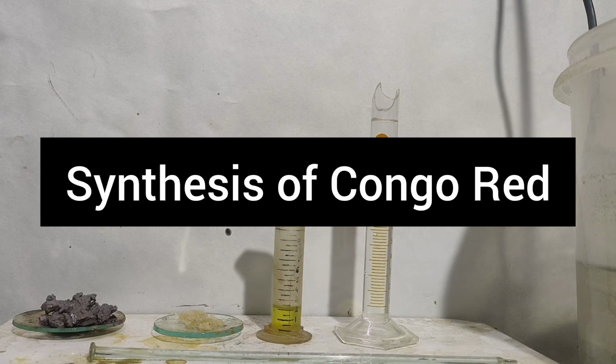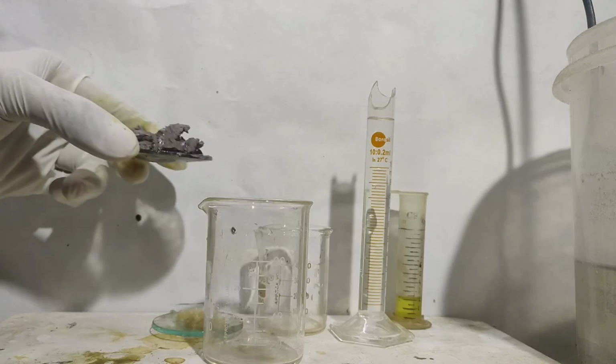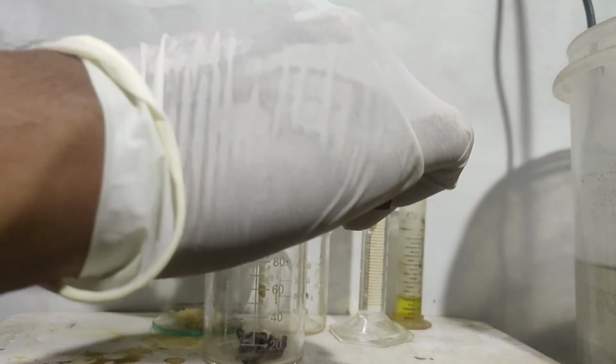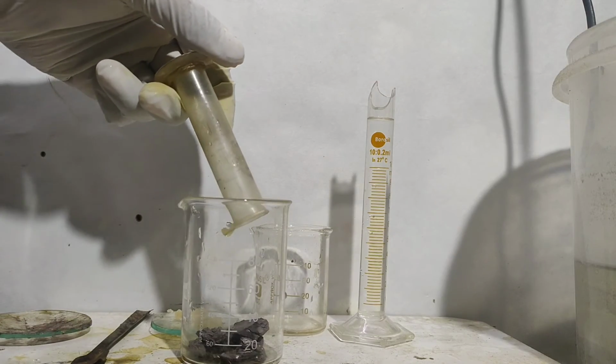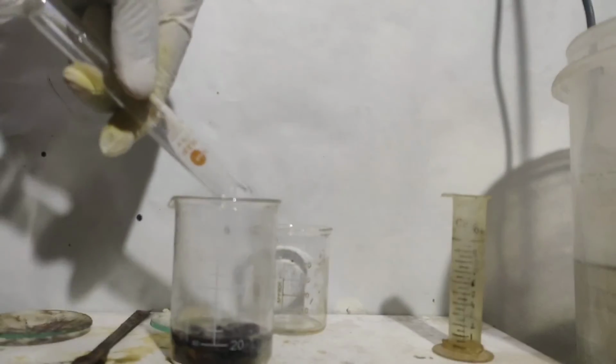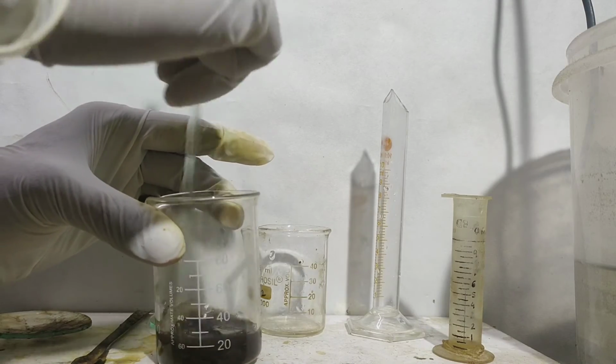Now to make Congo Red, I measured out 1.6 gram of benzidine, 1.24 grams of sodium nitrite, 2 ml of concentrated HCl and 12 ml of water. I transferred the benzidine into a beaker and added the HCl onto it. Then I added distilled water to it and stirred it.